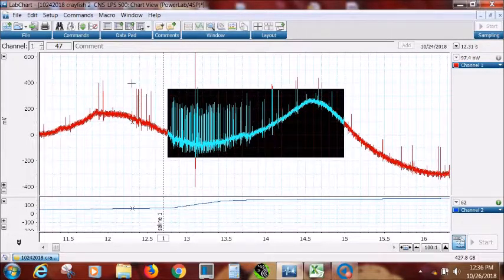So now we want to count over a certain period of time. Let's say it takes us really about 2 seconds to make the brushing on the side of the cuticle, because we brush down one way with the manipulator and then we brush back to the starting spot. So if we are consistent in our analysis, then let's try a 2-second analysis.